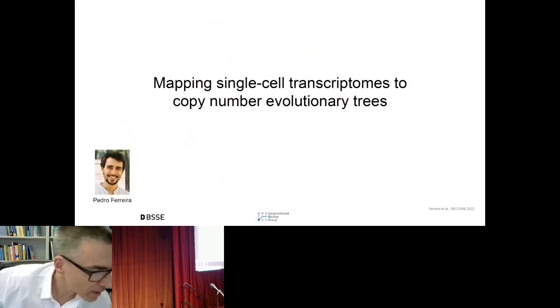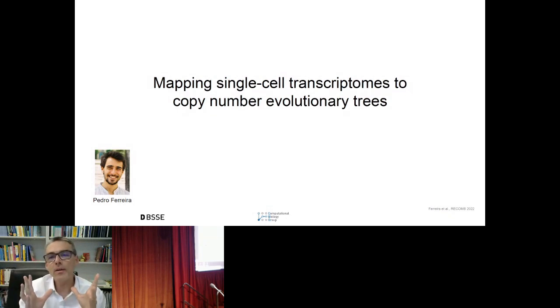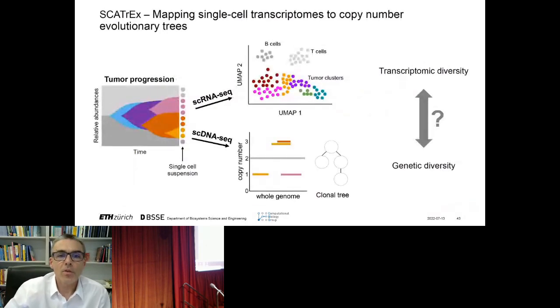Okay, for the last 3-4 minutes I may still have, I want to talk about analyzing single-cell DNA and RNA sequencing data at the same time. So now we're trying to integrate single-cell DNA and RNA data into one model. So the problem is now as follows. Again, we have a tumor evolving and sampled at a single point in time.